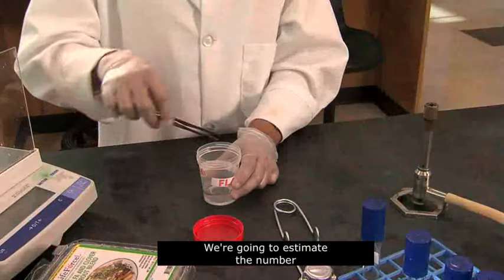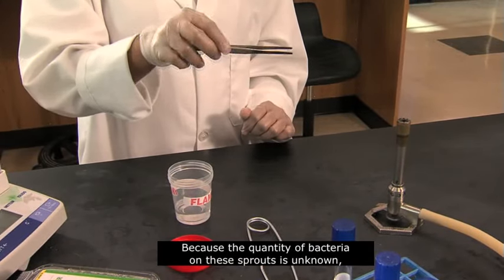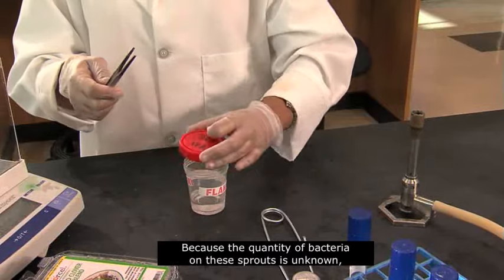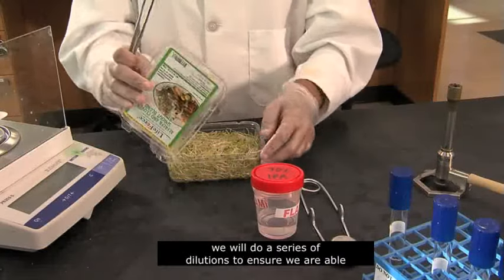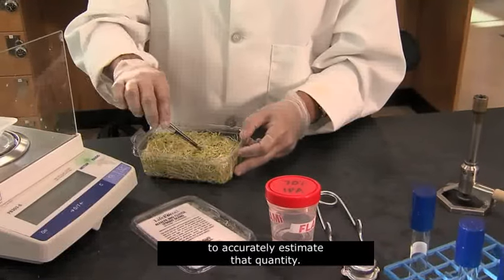We're going to estimate the number of viable bacteria on alfalfa sprouts. Because the quantity of bacteria on these sprouts is unknown, we'll do a series of dilutions to ensure we are able to accurately estimate that quantity.